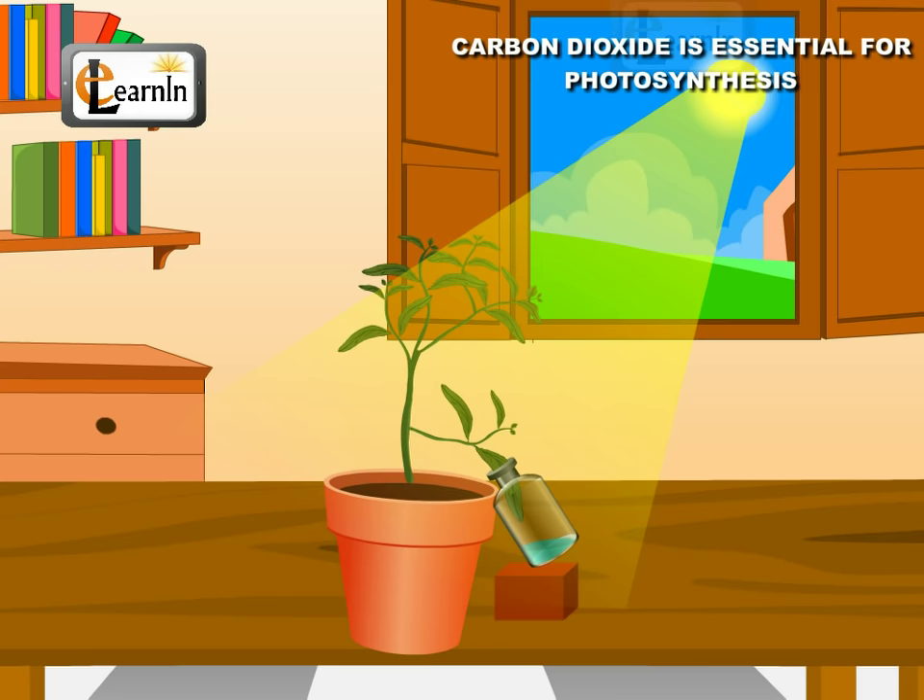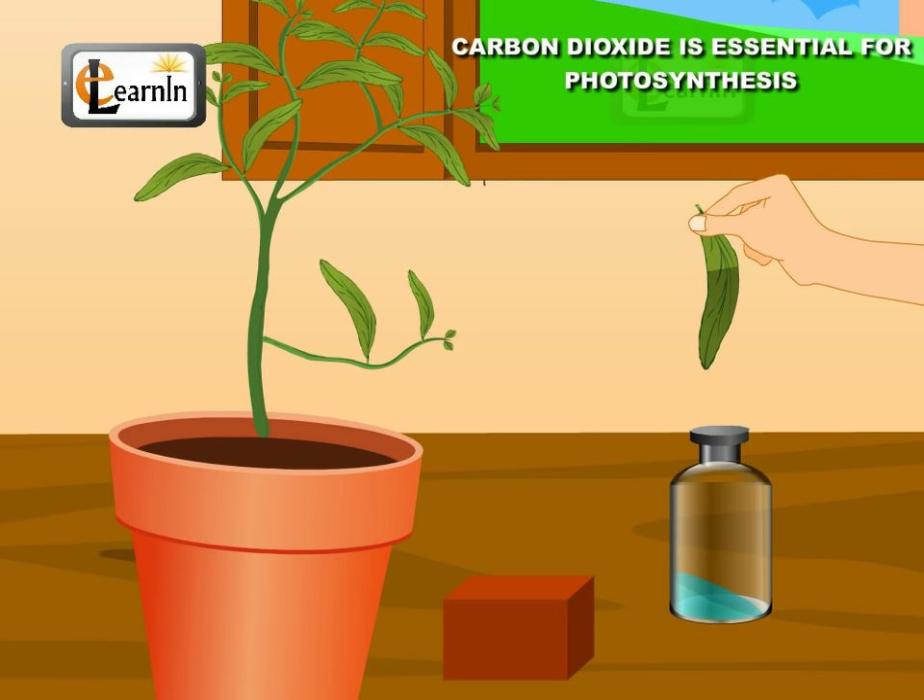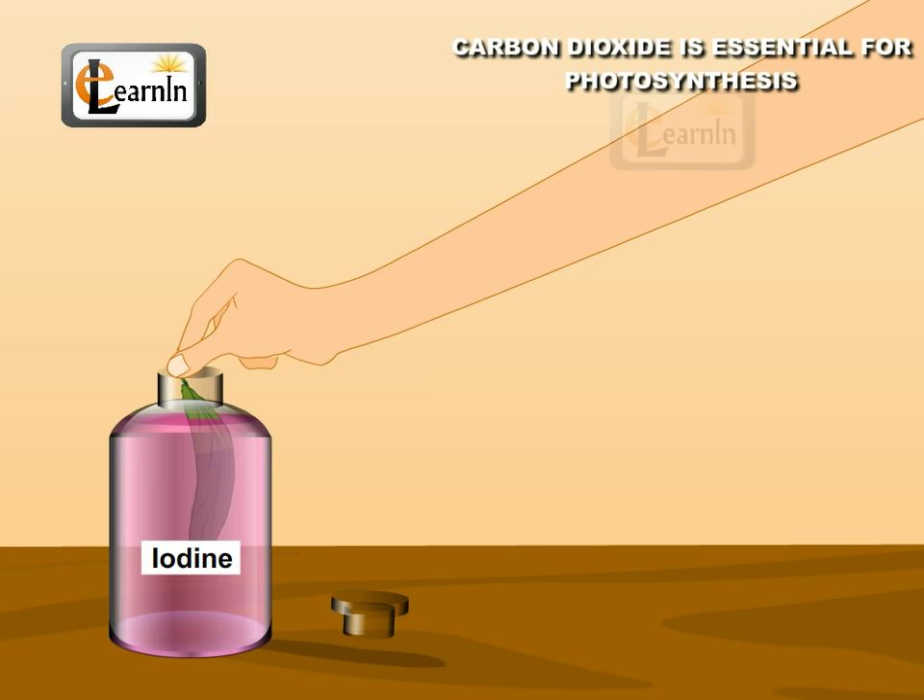Keep this unit in the sunlight for three to four hours. After three to four hours, detach the leaf from the plant and take it out of the bottle. Test it for starch with iodine solution.